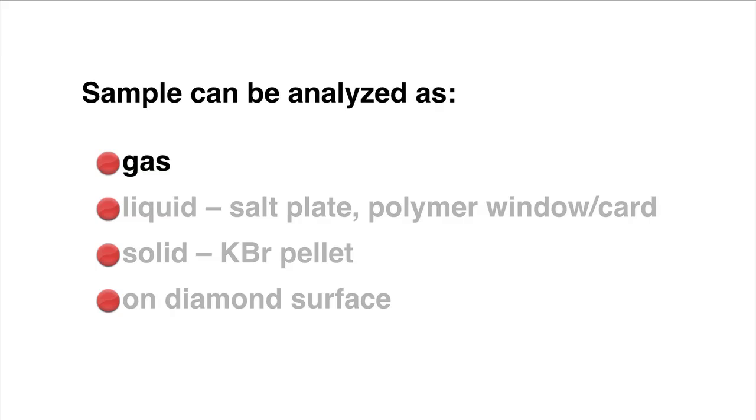In the undergraduate teaching labs at Northwestern we don't analyze gas samples because you need a special sample holder that can contain a gaseous sample, but we do routinely analyze samples that are liquids. Now there are two common ways to analyze samples that are liquids.